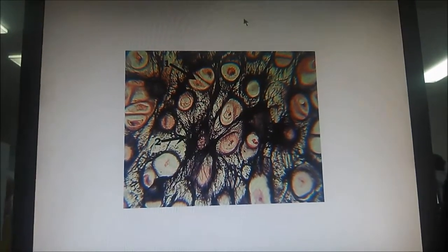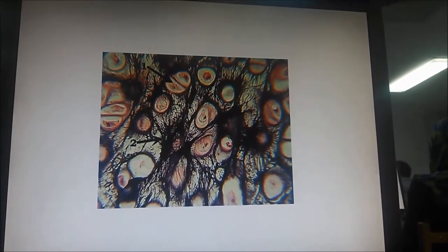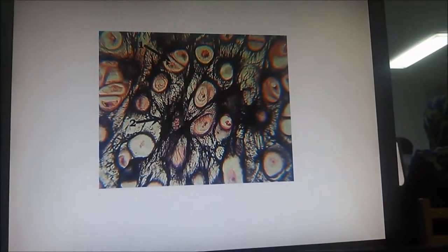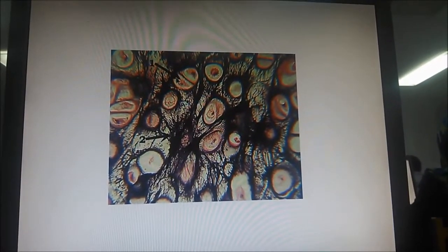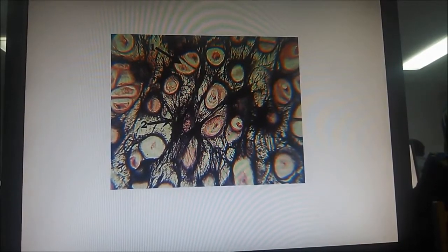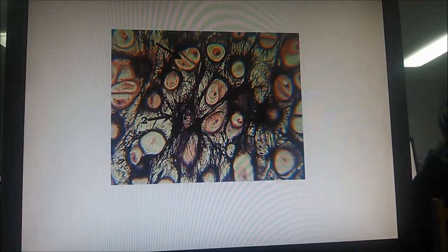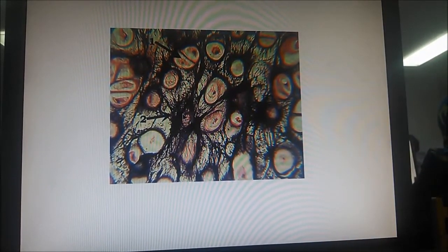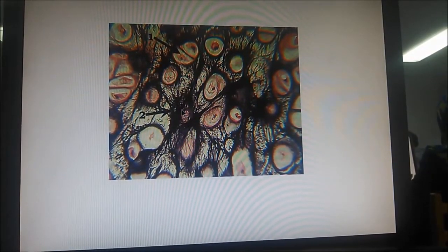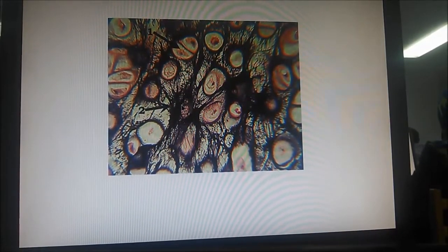Same, okay, clearly, chondrocyte cells, بيعمل couples. الماتريكس it does contain dark fibers. يعني number one ايش؟ Number one الchondrocytes وهنا isogenous group. You have two, they share the same lacuna. Now number two شو هو؟ Elastic fibers in the cartilage matrix. What do the elastic fibers stain? They do not like the silver. This is what we call an Orcein stain. Orcein, which is the typical staining mechanism for the elastic fibers.